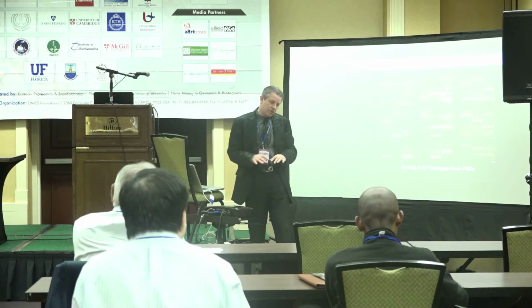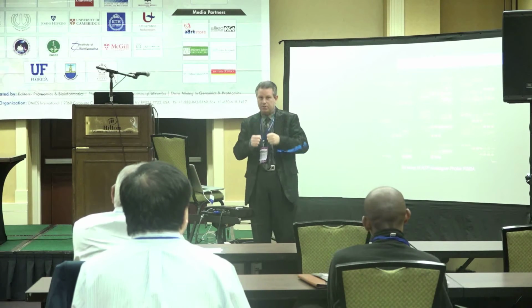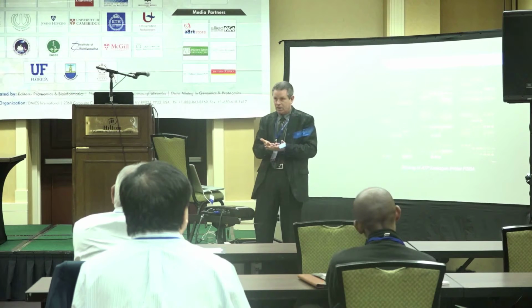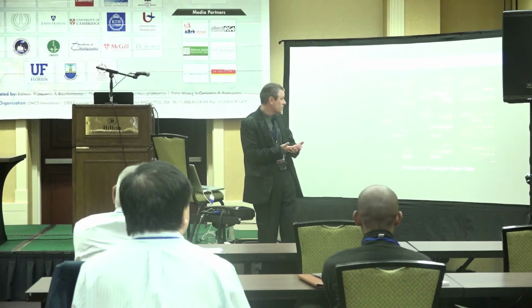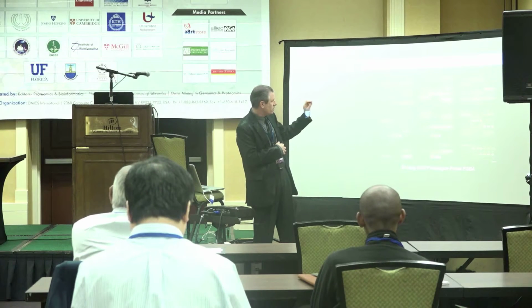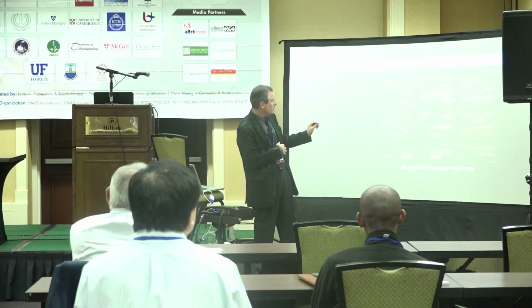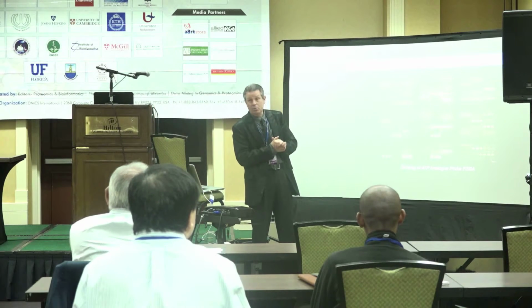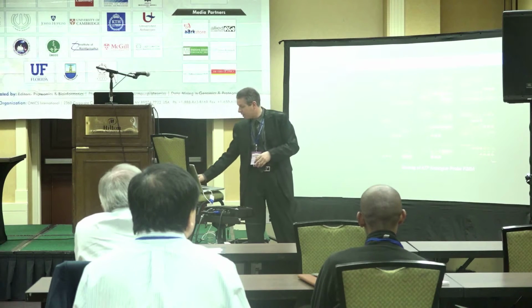But one of the things that we did a few years ago was we took purified kinases and put them onto microarray chips. We wanted to use these to see if we could do drug screening. What you see here is part of an array where these kinases were printed at triplicate spots, and then they were probed with the FSBA probe. The FSBA covalently attaches, and this probe was biotinylated so we could quantify whether we got any binding.